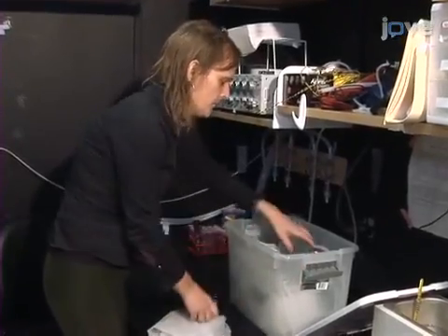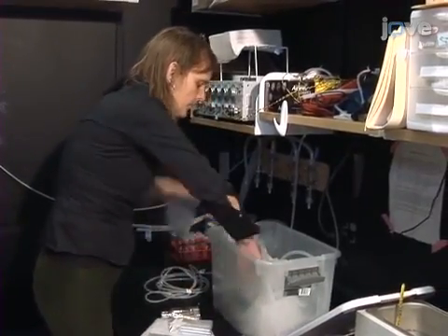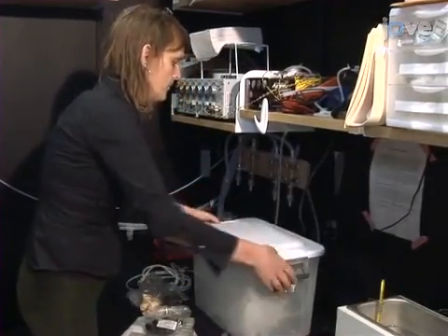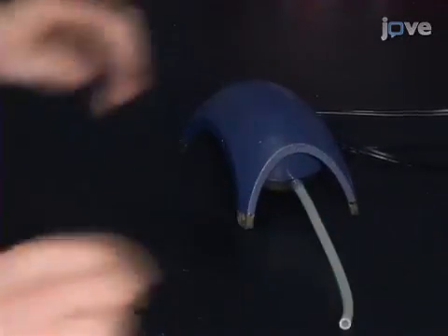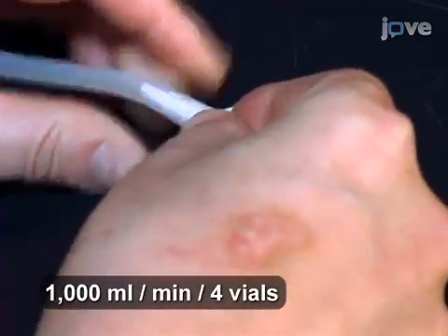First, assemble the FlyBar. Start with assembling the airflow. Connect a short piece of flexible silicone tubing to either a building air tap or an aquarium aerator to provide airflow. Split the airflow with a Y connector.